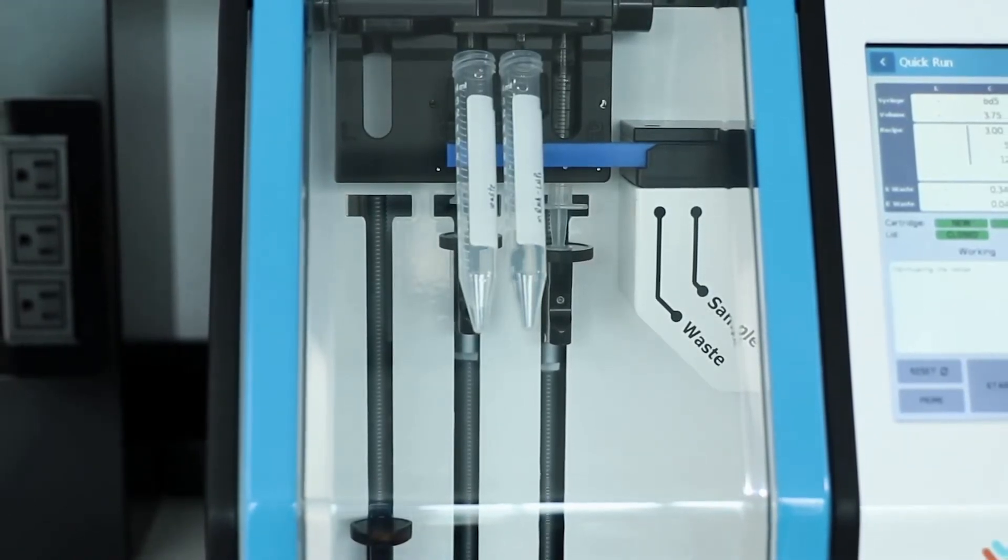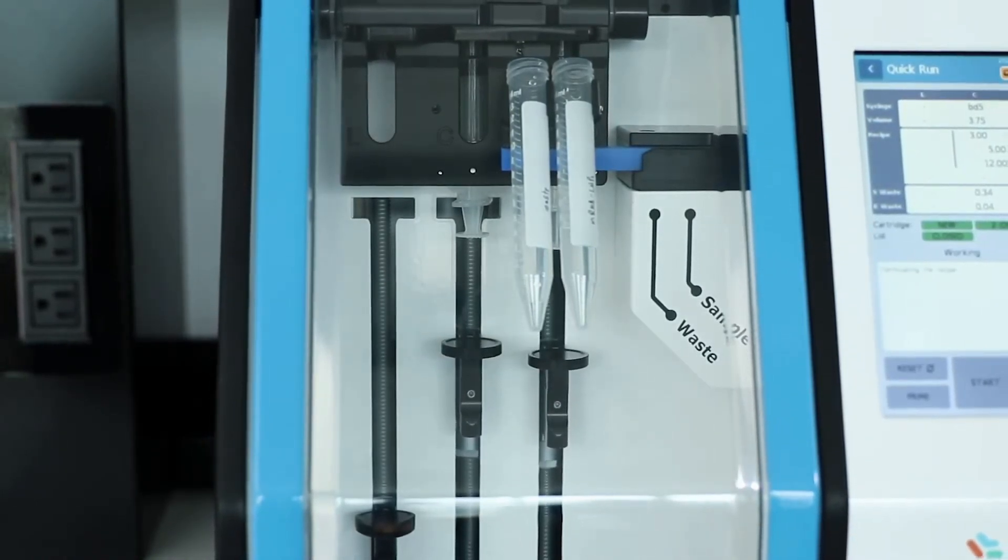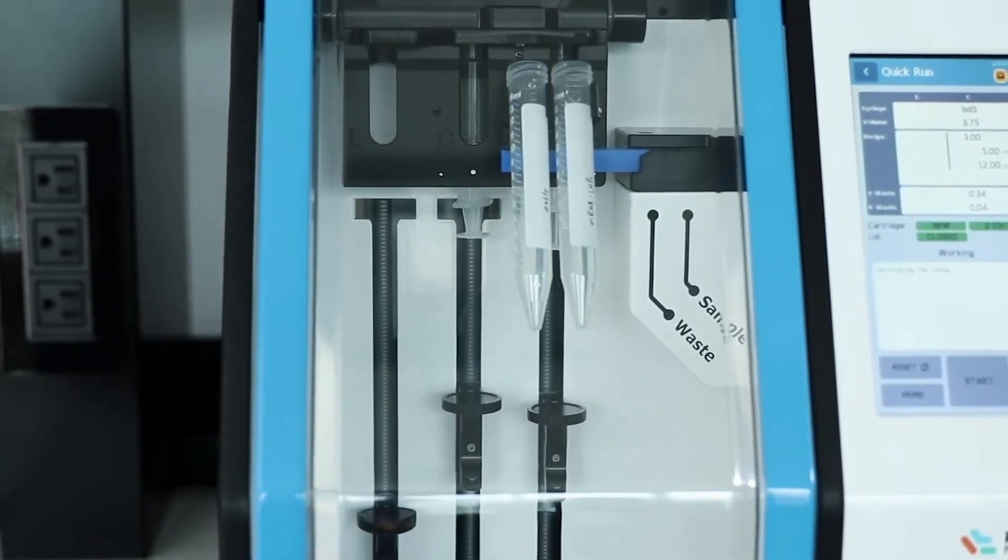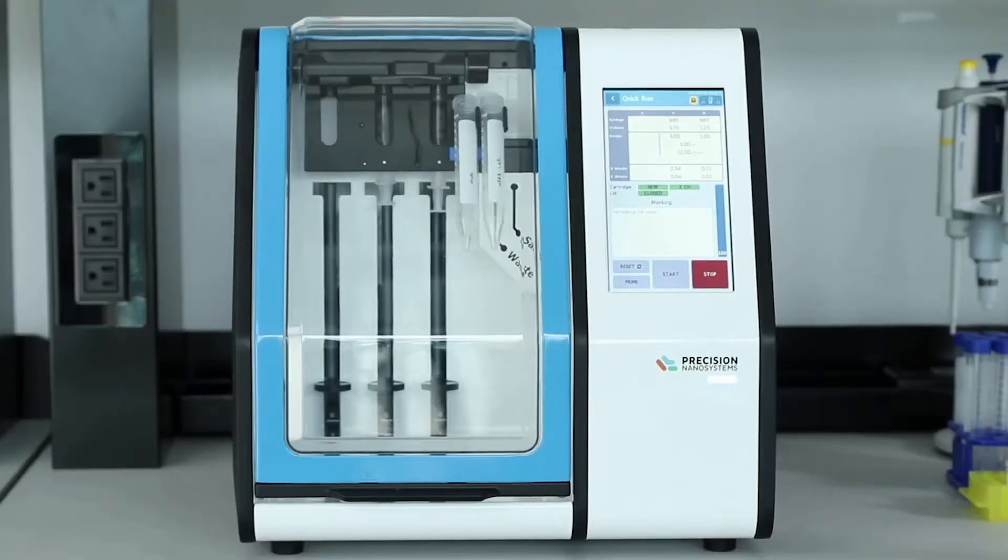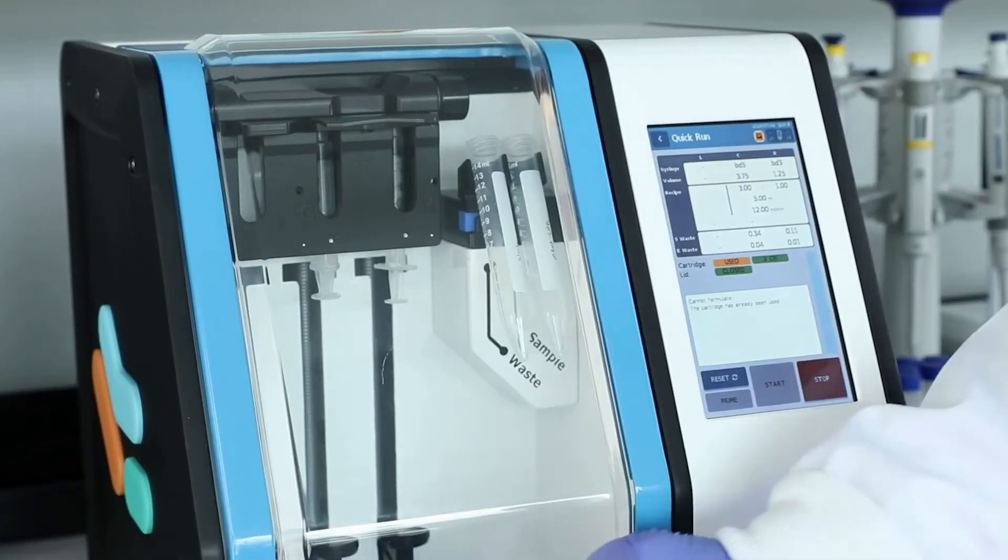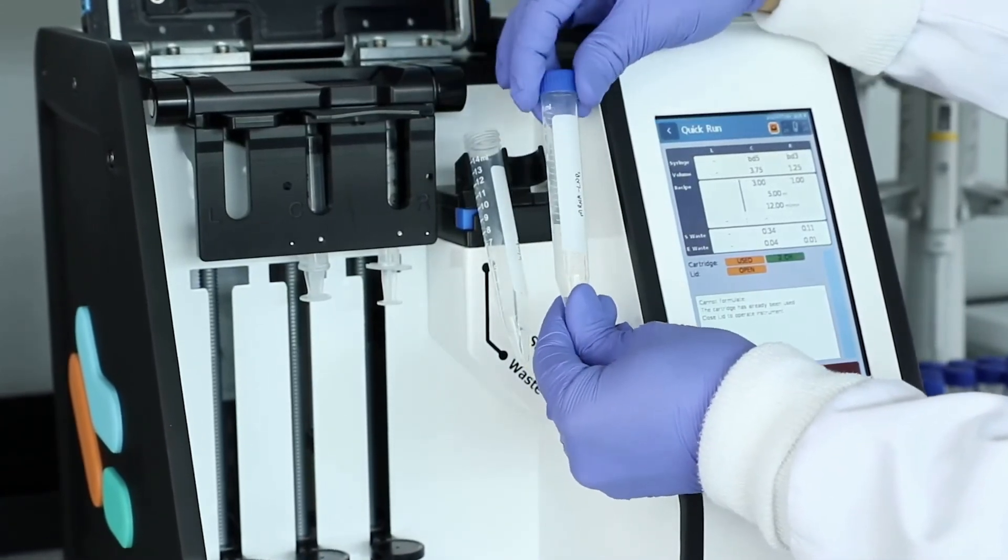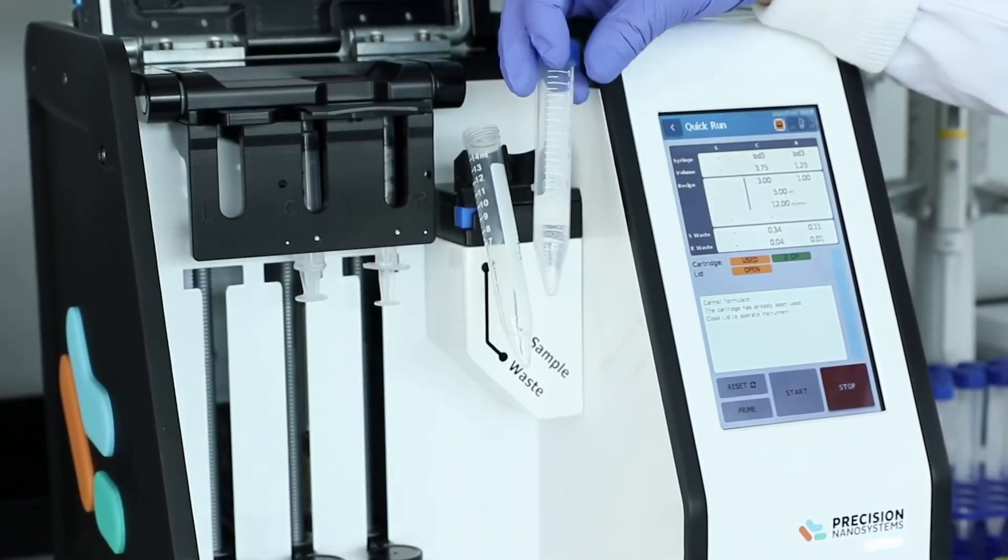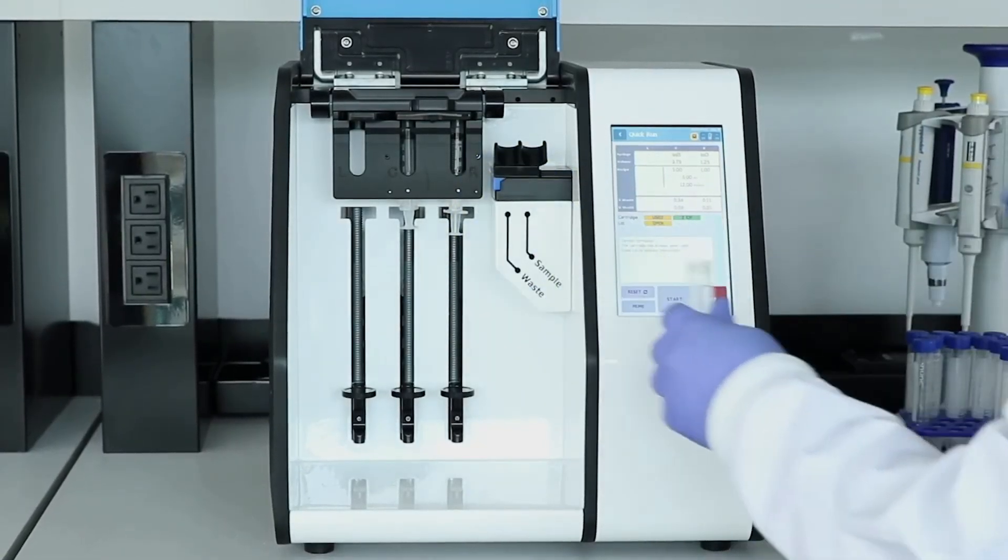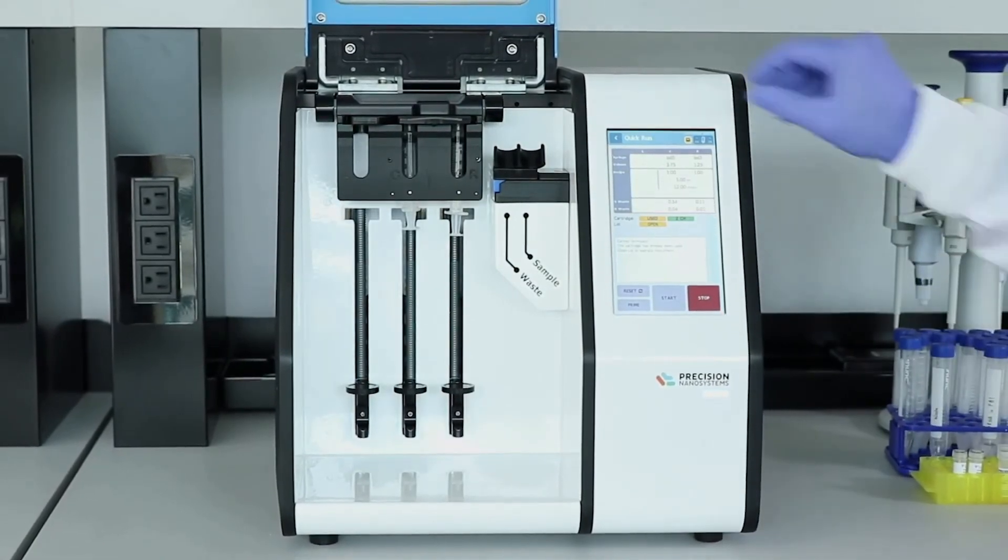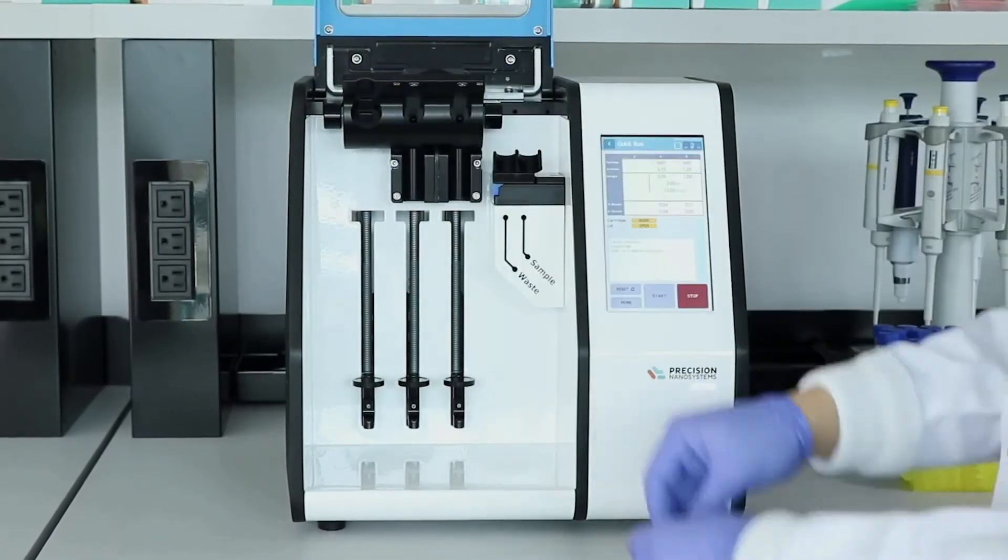You can make formulations between 1 and 15 milliliters pre-dilution, which is ideal for exploring the formulation design space and evaluating formulations in a range of in vitro and in vivo models. The next step is to prepare the particles for dosing, which involves particle purification by either centrifugal or tangential flow filtration and finally sterile filtration. The ease of use, speed, control, reproducibility, and scalability make the Ignite a tremendously powerful preclinical development system.